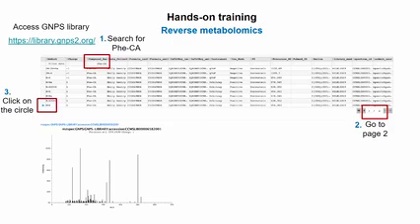You'll see the dehydration products, and that's about all. Yeah, we also have a different strategy in place now, so you can make sure that these are there in the MSMS spectra, even though the intensity is below, let's say, 5%. We also have peak filtering that will be released soon, available to everyone, so you can have a second step of filtering to make sure those peaks are there and that these are truly bile acids. Yeah, and that will be there.